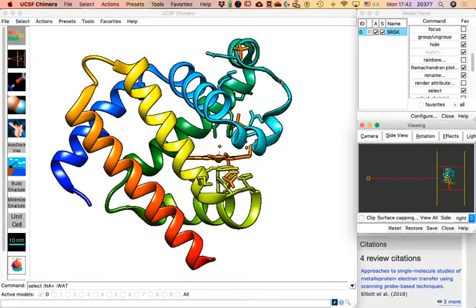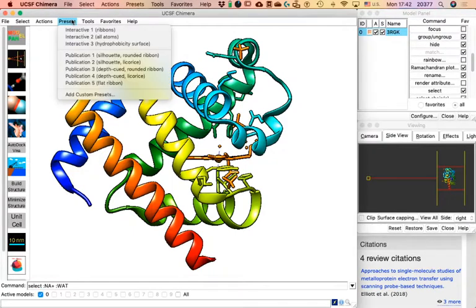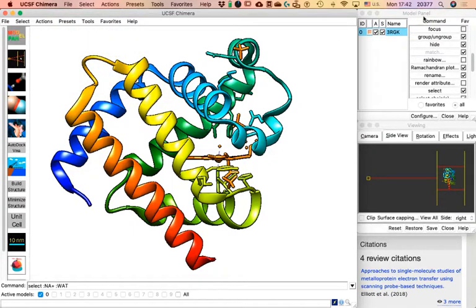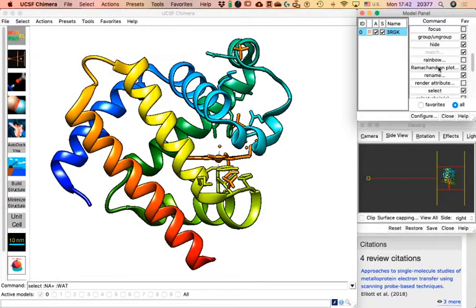It's exactly the same as the preset, but we have to go into the menus to find the option and apply it. That's the difference between having a preset versus going to the options in the control panel.